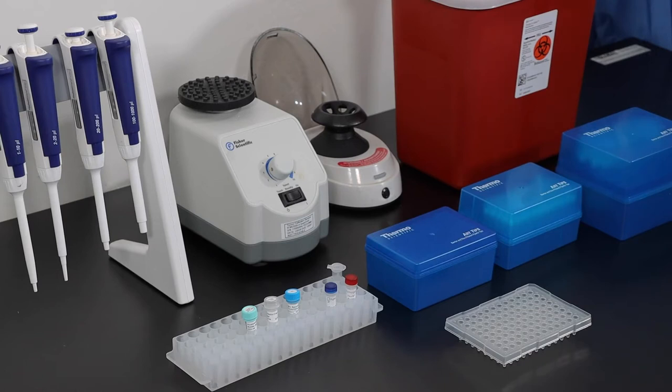The PCR prep area is a sterile area completely isolated from the sample prep as well as the hybridization areas to prevent contamination.